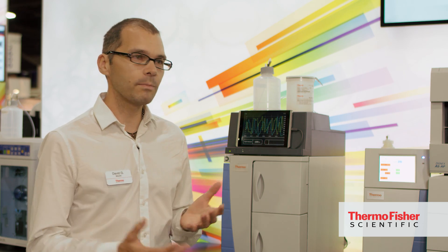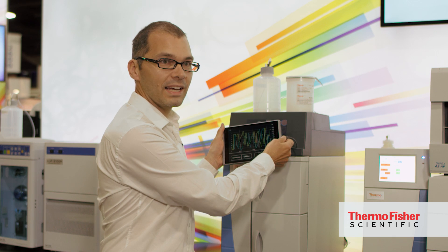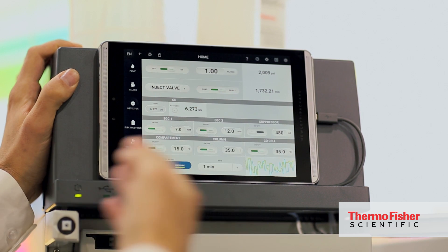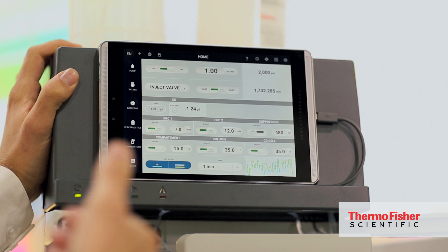One simple example is the tablet up at the front here. Customers are very familiar nowadays with tablet instrumentation. They have access to all their common parameters to operate the instrument up at the top, and if they need to, they can go into more detail in subscreens.